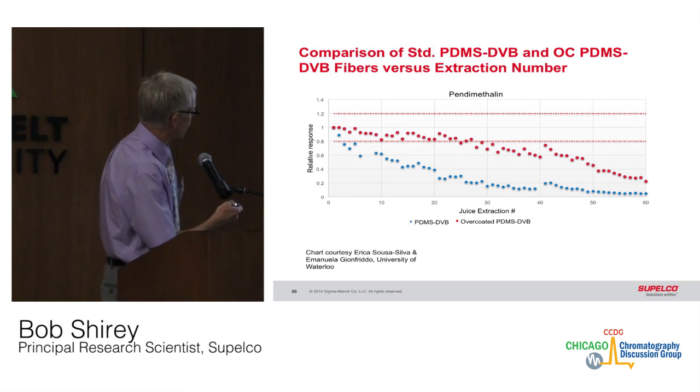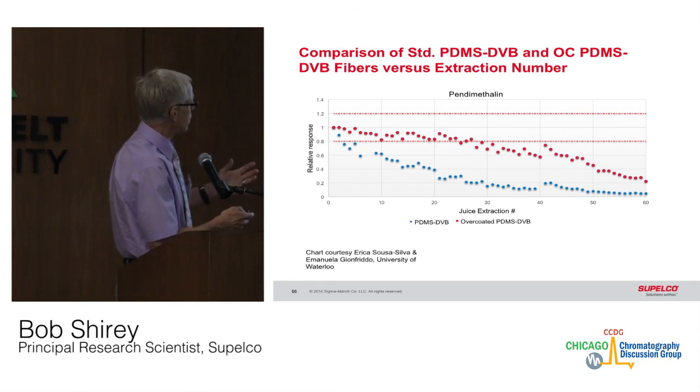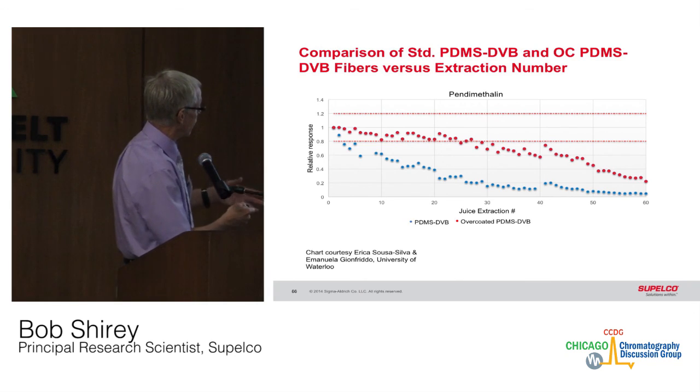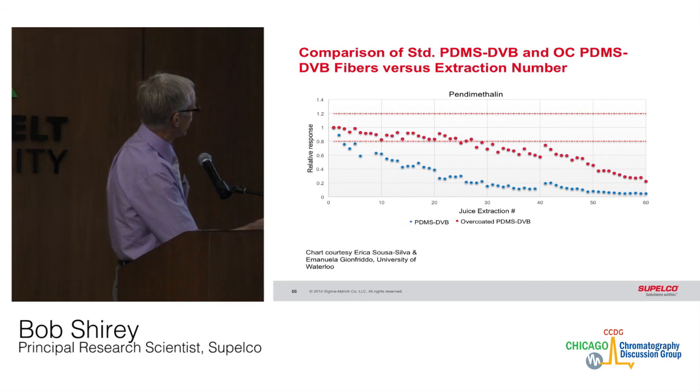This shows that what we did, we extracted 20 samples at a time, inspected the fiber, and then extracted another 20 samples with a fresh set of samples. So we spiked 20 every time. And so what you see is this pattern of decrease, and then you get a little bit of a lift because the pesticide does bind to the matrix to some degree also. That's why over time it even drops further.